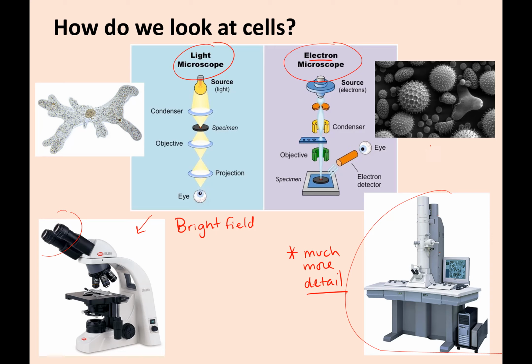So these are actually pollen grains. Pretty cool looking. And this is an amoeba. I always spell it wrong, I think. Maybe I spell it right.